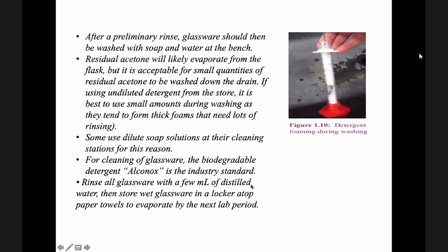From our experience, we used distilled water meant for battery use. Then we found out that in our phosphate analysis, the blank was already positive, and the samples had very high readings.